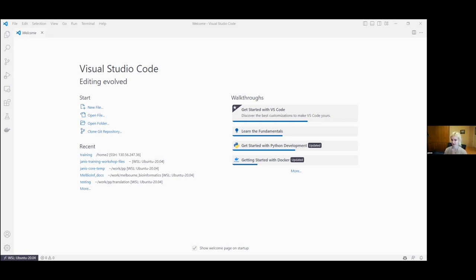Lots of people saying yes — I'll assume we have Visual Studio Code. The next step is to make sure you have the two extensions we're going to use today. On the left-hand side of the screen you've got the extensions tab — it's got four squares. Click on that and type in Nextflow, then you'll see Nextflow language support which you can install. It just gives you syntax highlighting and that kind of thing.